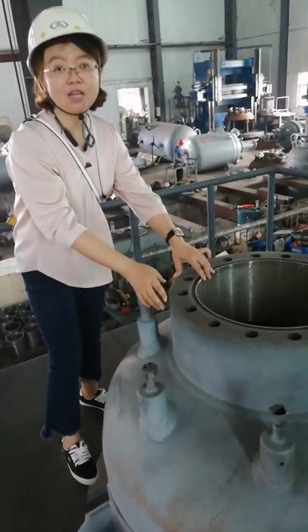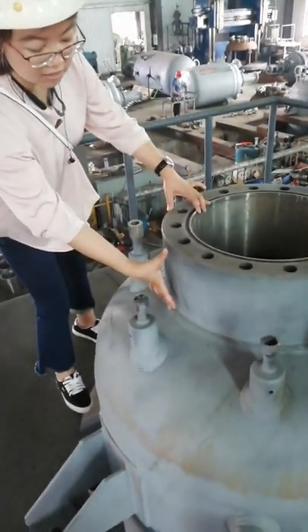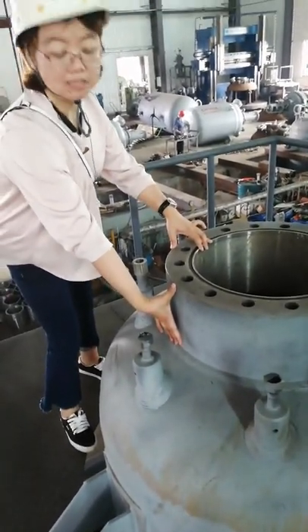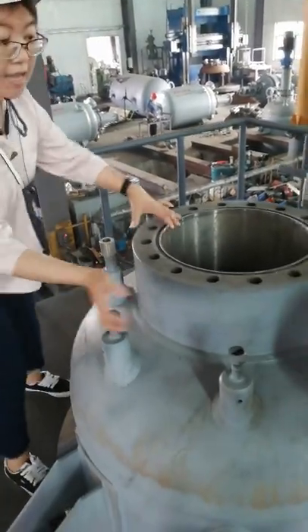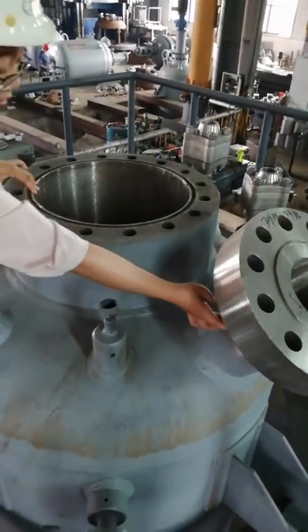This is the super high pressure reactor. The outside is a carbon steel forging part which can withstand super high pressure. For the kettle nozzle, there is a reinforced tube also made as a forging part.